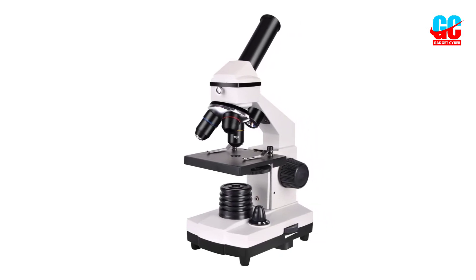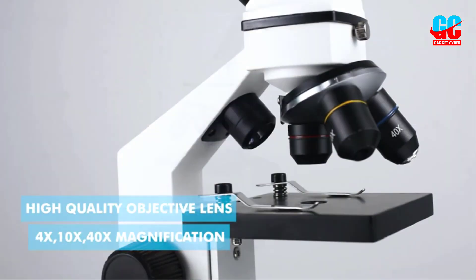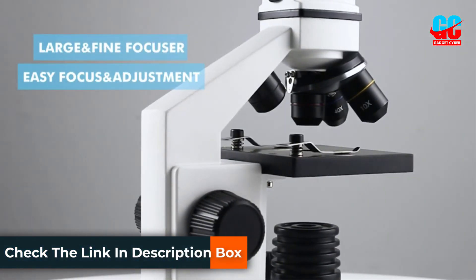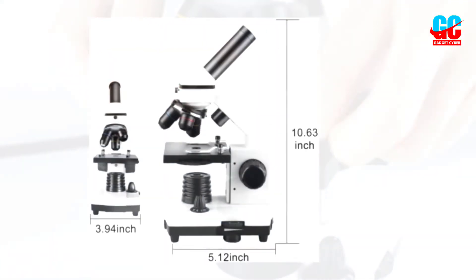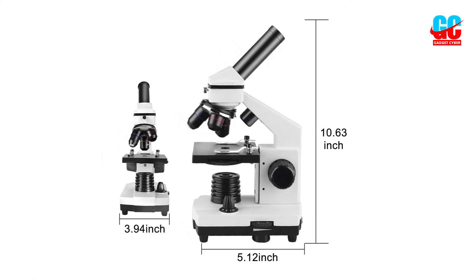Unfortunately, the range is very limited, spanning from 40x to just 640x. Many of the lower-priced models we tested offered much higher magnification ranges than this. We greatly preferred the dual eyepiece models for their easier and more comfortable usability. The Gossky only offers a single eyepiece, though it's priced closer to the higher-end dual eyepiece devices.